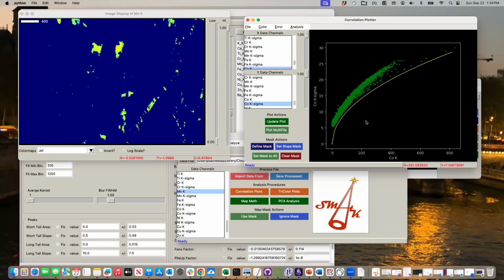What you really want to make sure is that your data is not so far outside of these lines here that you can't trust it, that your error bars, your sigmas, are so large. At any point here, I can always go to File and export all that data.